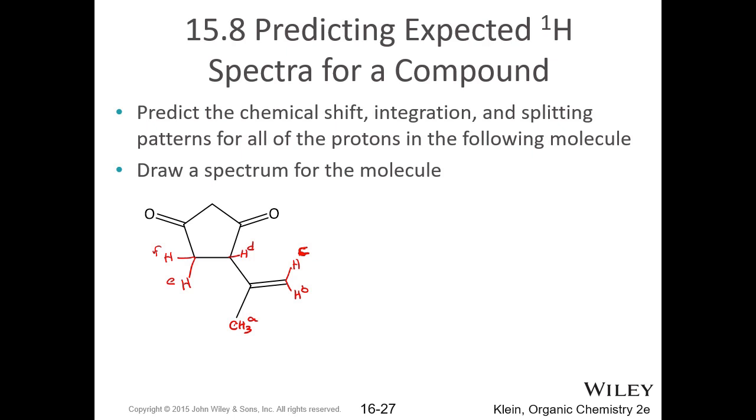Just to make sure that I'm not messing this up, would those two hydrogens, not the one closest to the carbon double bond, like the carbon oxygen double bond, would it not be influenced by it? Are we talking about the methylene group here, or are you talking about the alkene? Here, the closest to the oxygen carbon double bond over there, the F hydrogen. F. Yeah, E and F are distinct because it is chiral. If it wasn't chiral, E and F would be the same. Even if it's closer to that, or no, it doesn't work that way. Yeah, it doesn't work that way. If it's chiral, they're going to be distinct. If it's not chiral, they will be equivalent.